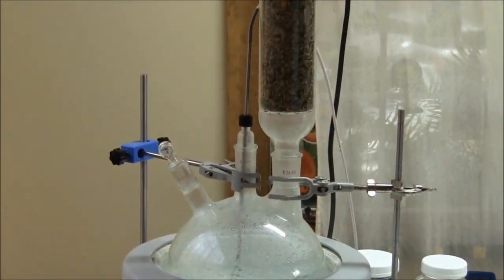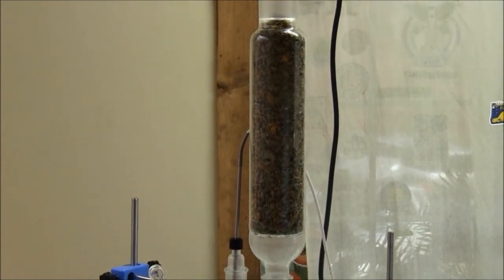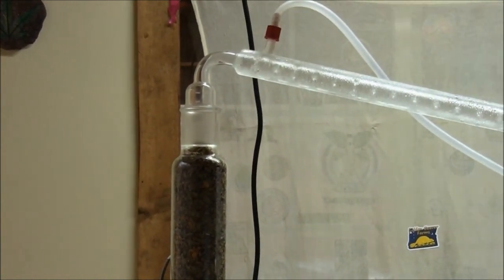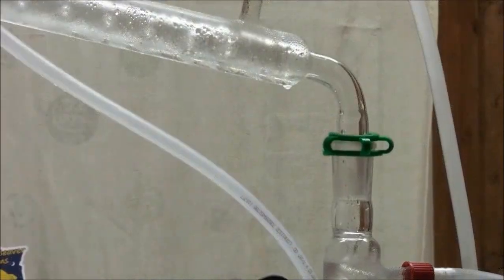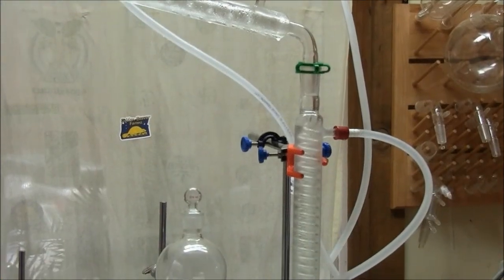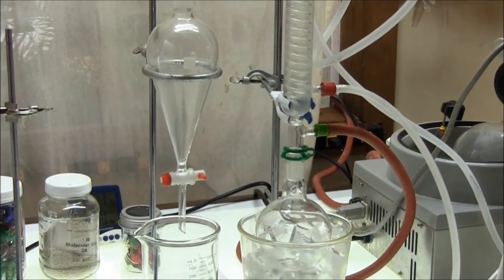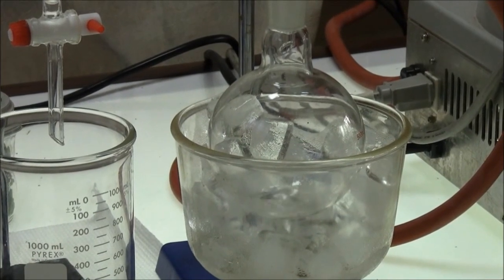We've got a 5-liter mantle here. We've got that filled with water. And above that, we've got our biomass chamber, these nice cylinders that we've got packed with biomass. Up above that, we come into the Liebig condenser. And as the distillate starts to bend and drips down into the Graham condenser, it'll slowly pass through the Graham condenser, going around the different coils, and that'll reduce the velocity and bring the temperature down quite a bit. And then finally, it's collected in the collection vessel.